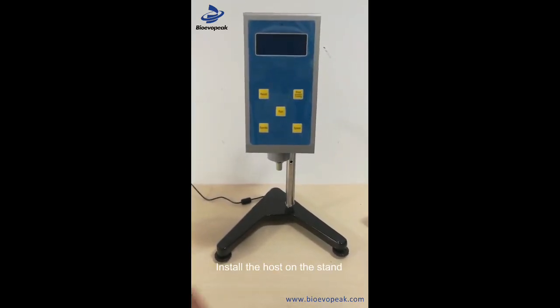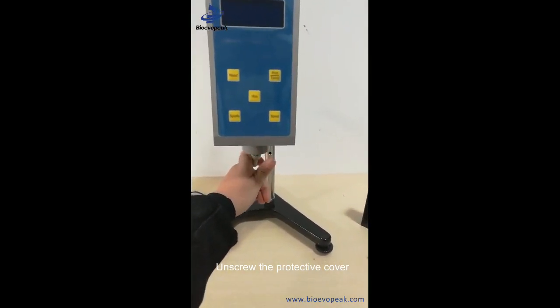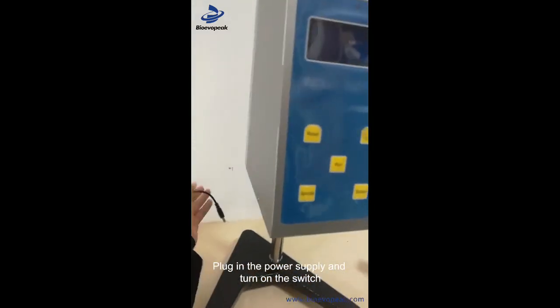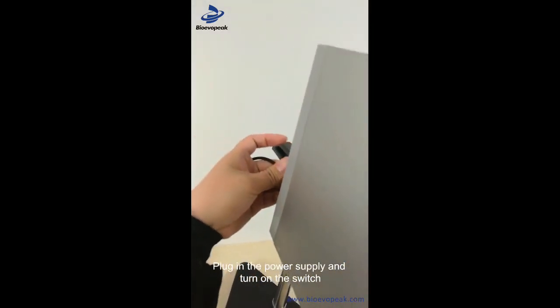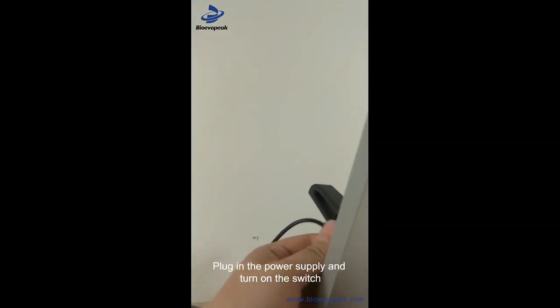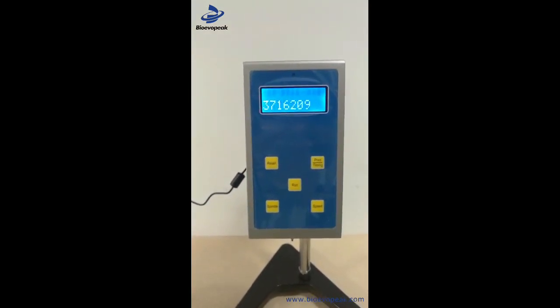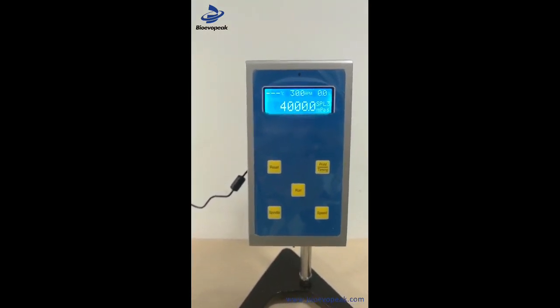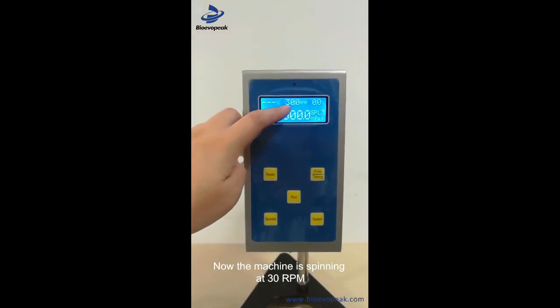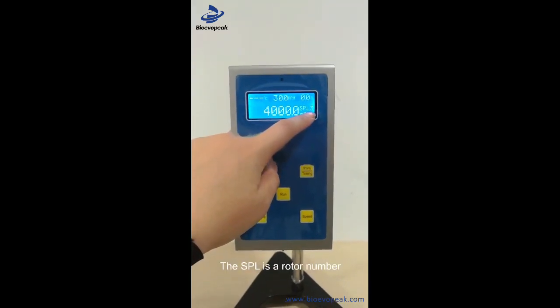框架单元，把主机撞在座驾上，把保护套扭下来，插上电源，打开开关。现在机器在30转，转速在30转上，这个是SPL，是转子号。(Frame unit, mount the main unit onto the stand, remove the protective cover, plug in the power, turn on the switch. The machine is now at 30 RPM; SPL indicates the rotor number.)